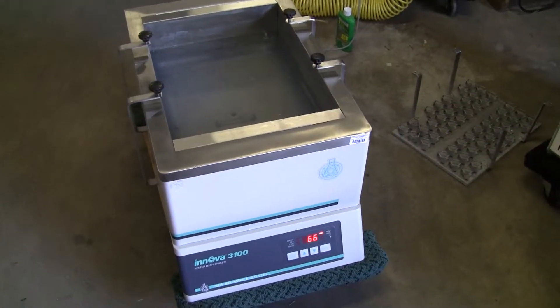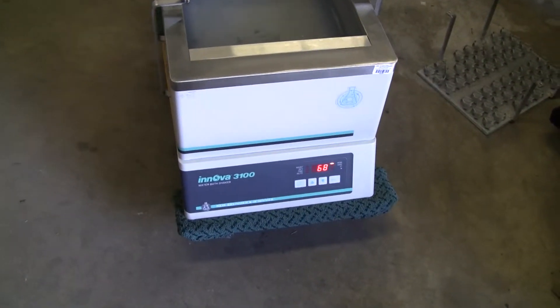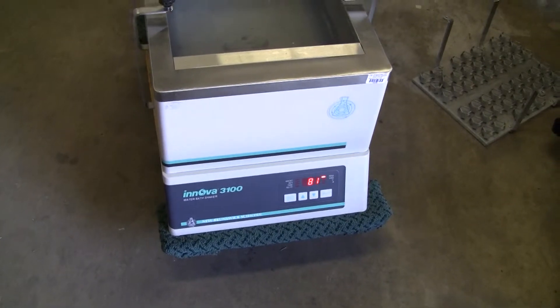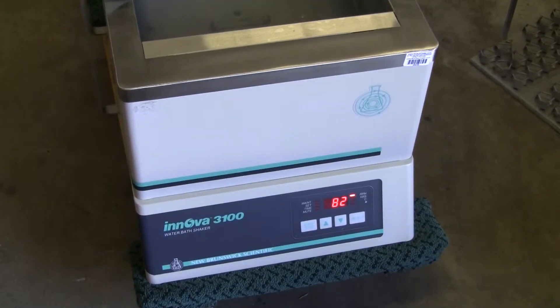Hi, this is Michael Natow from Hitech Trader. Today we're looking at the Innova 3100, manufactured by New Brunswick Scientific.